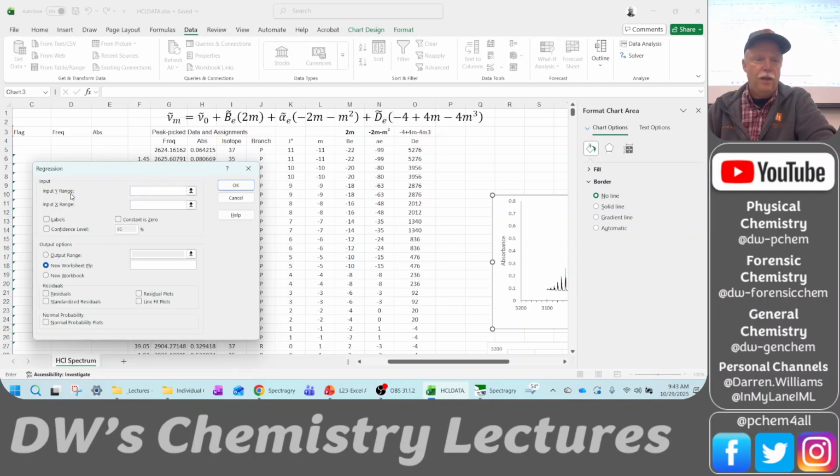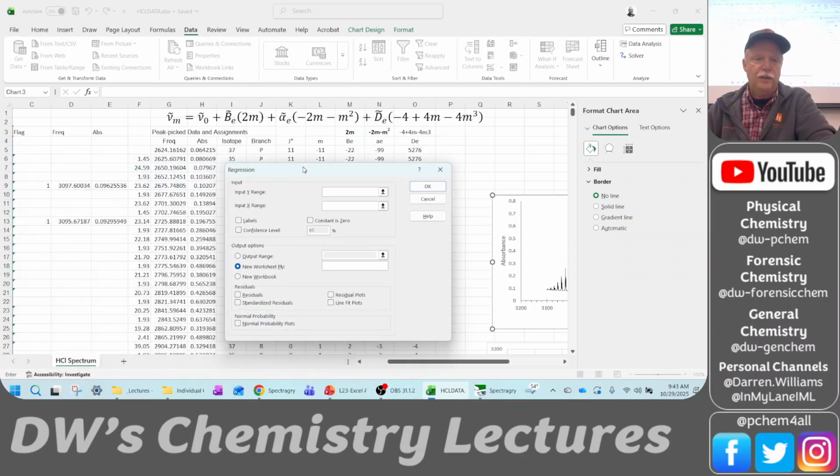Now, Y range. These are our frequencies, because this whole equation up here gives us our transition frequency. And so the dependent variable is our frequencies. So I'm going to include the label. I'm going to do Control-Shift down. Why is it not doing it?